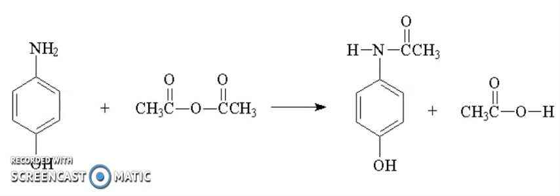Add 0.3 to 0.4 gram of decolorizing charcoal to the solution. You know, this is much more than usual but necessary because the crude para-aminophenol contains a lot of polymeric materials. Swirl the solution on a steam bath for 4 to 8 minutes and periodically check to see if the solution is decolorizing.